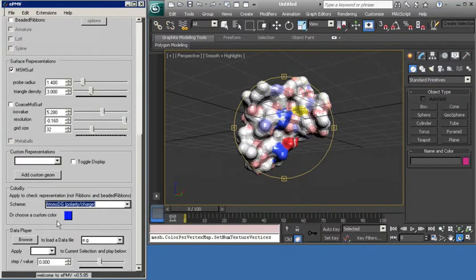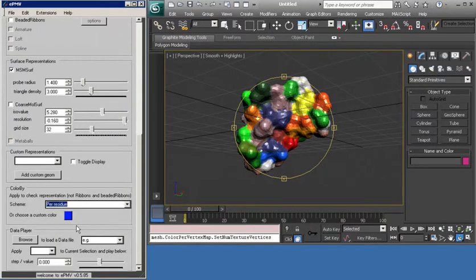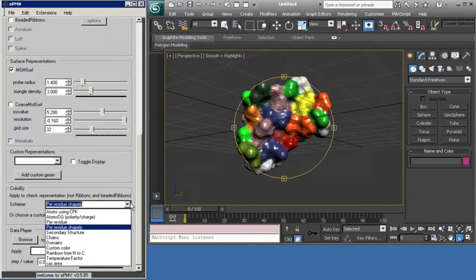We can see the residues, and these are just different canonical colors, one representing every residue in the molecule, and there's a different coloring scheme, but it's effectively doing the same thing. It's just a different color selected from a different underlying molecular graphics software package.